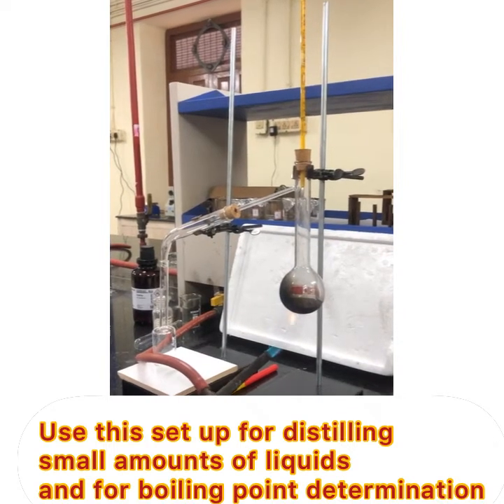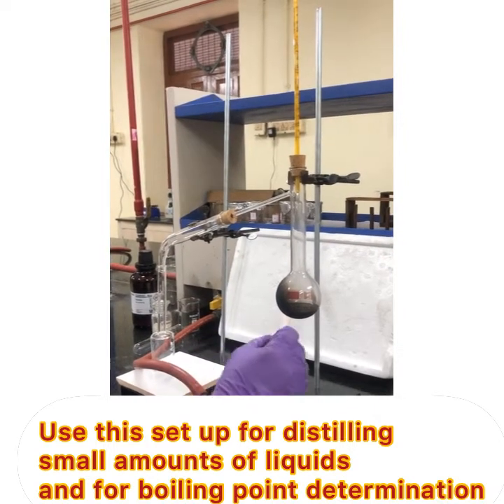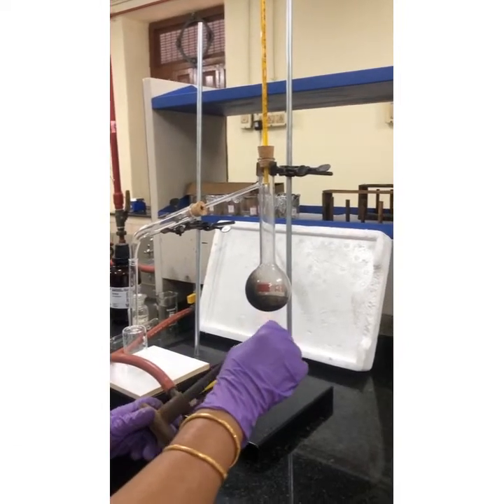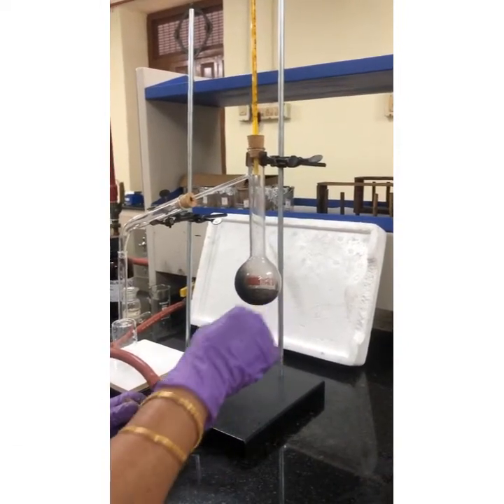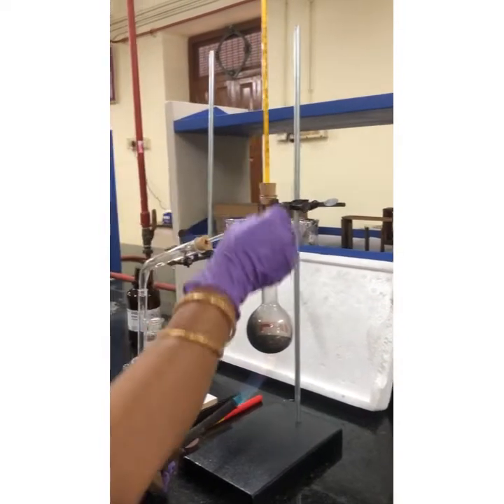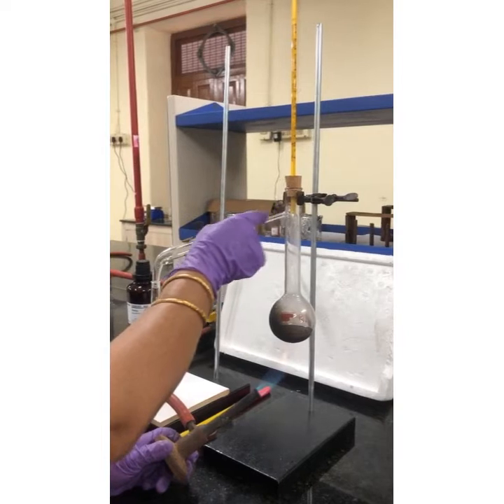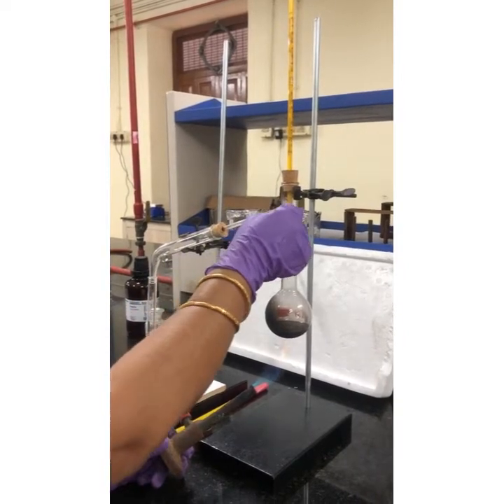Only for small amounts of liquid should you use this setup, as it does not have a water condenser to condense the liquid vapors, so you have to finish the distillation fast. After reaching the neck of the flask, the liquid is now condensing down the receiver tail and the pure liquid is being collected.